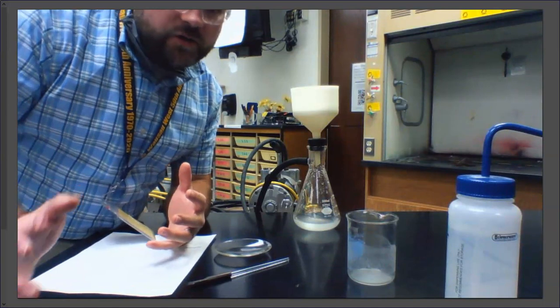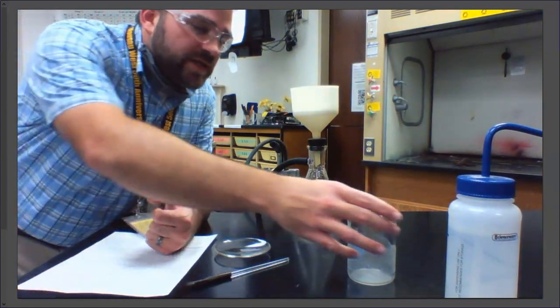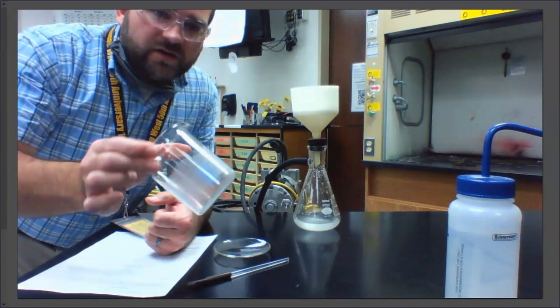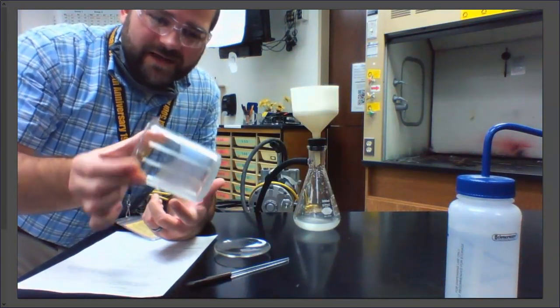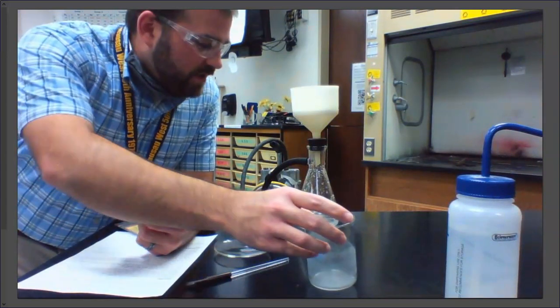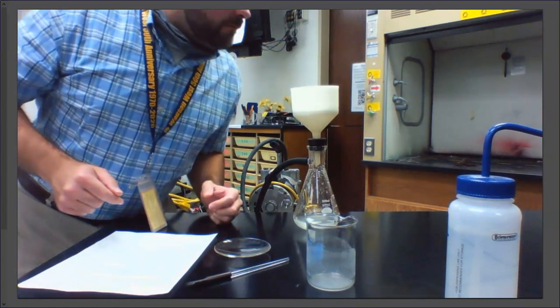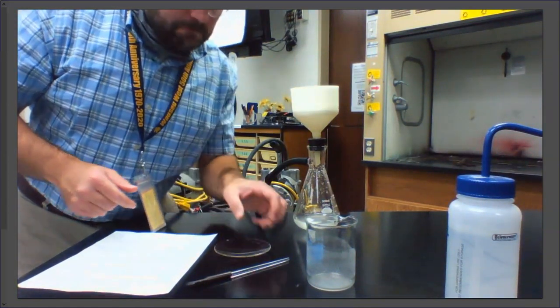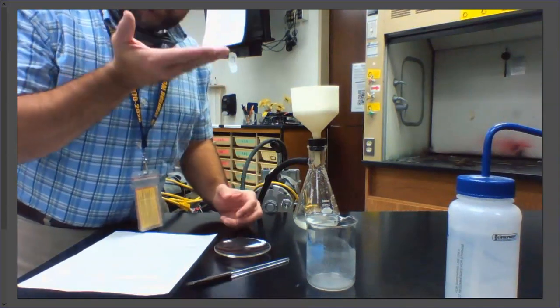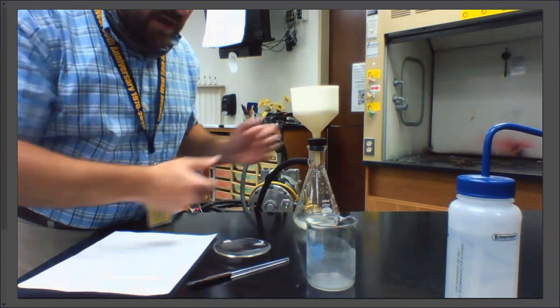All right, so I'm done transferring over my product, my precipitation reaction that we just completed. You'll notice my beaker's still a little dirty. It's going to be really tough to get every last little bit. I've sprayed this down and rinsed it quite a few times, but this is about as good as I'm going to be able to get at the time, so it is what it is. Inside my funnel right now, I have the filter paper, and it's obviously still wet, but there's a whole bunch of white powder trapped in the middle now as I was pulling that and drawing that through.